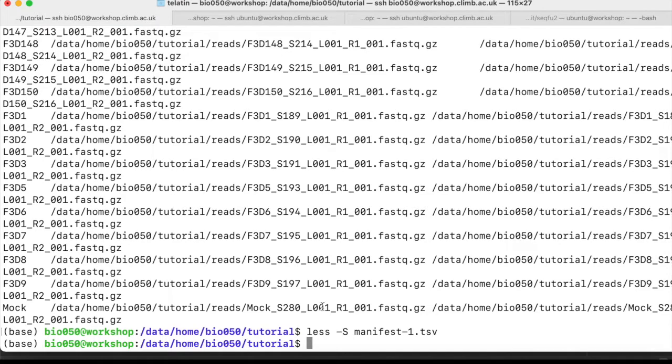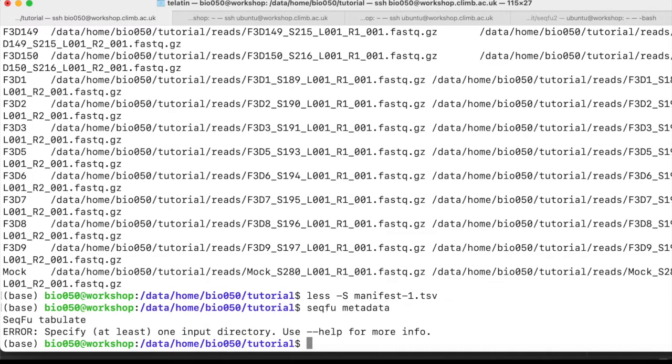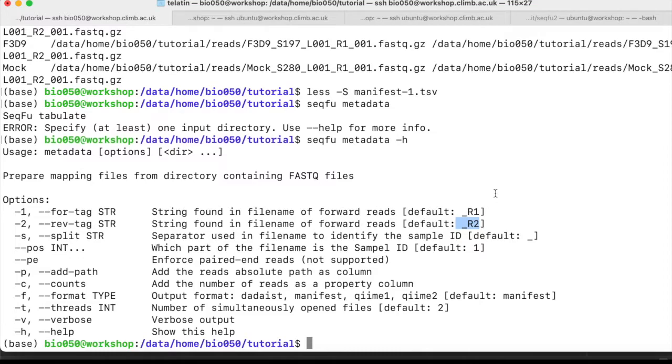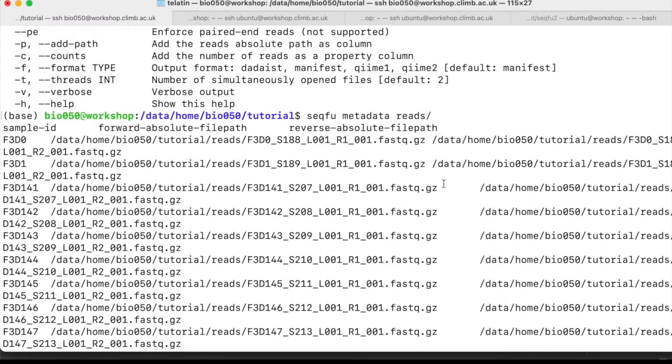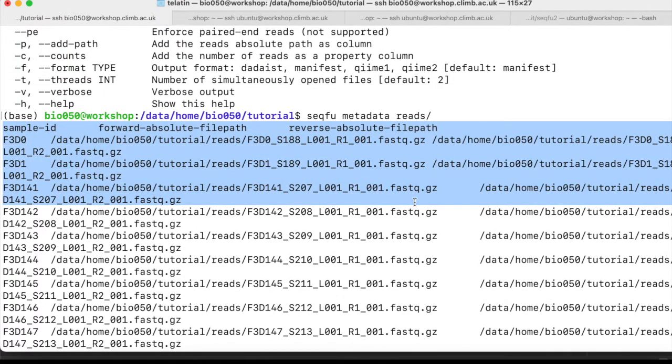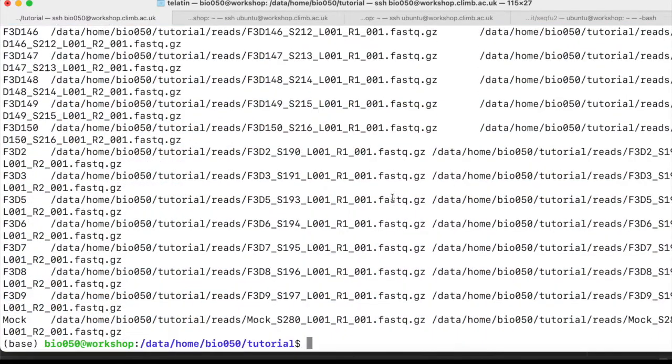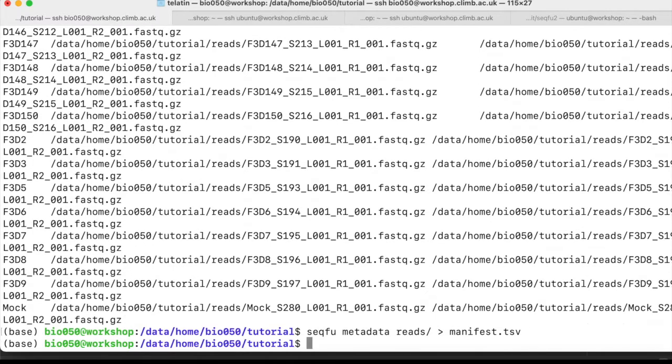Now, if we want to have a small shortcut, and I think we do, seqfu metadata can create a blank metadata file starting from a directory. So in our case, we have a reads directory with some reads. We can specify the tags that specify which reads are forward and which reverse, but by default they are the Illumina tags. So seqfu metadata reads will automatically create a full manifest file with the header and all the files that we need, and we can simply redirect the output to a new manifest.